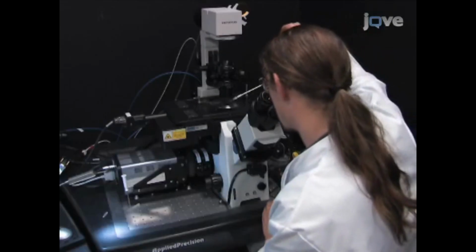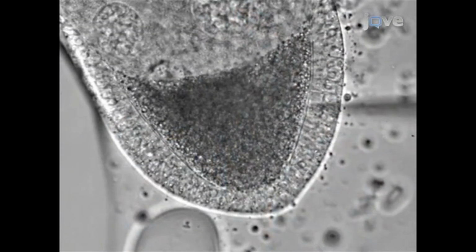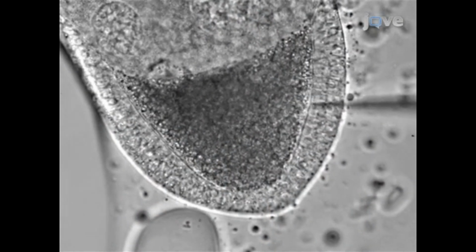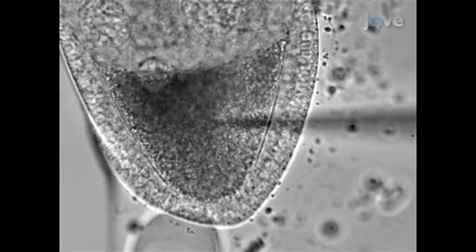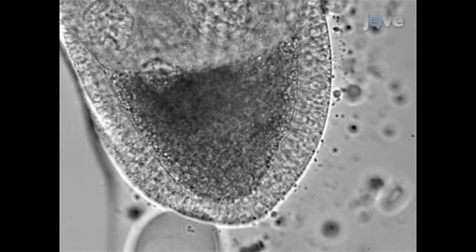Before selecting the next marked oocyte, raise the injection needle high enough in the oil so that it does not bump into other oocytes. Extensive stabbing or lingering with the needle inside the oocyte severely damages the egg chamber, so be quick. The injection should take less than 10 seconds.